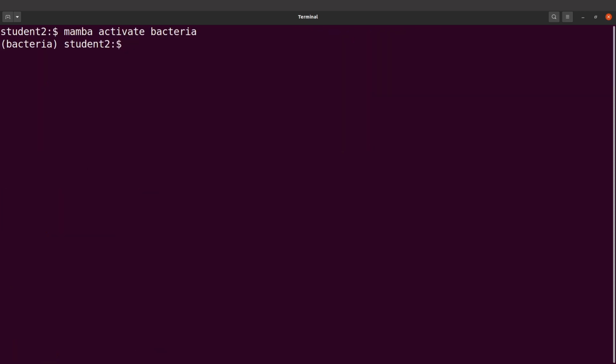So what we are going to do next is to create a working directory and then cd into it. So I'll say mkdir MRSA. You can use any name of your choice, it's fine. Or you can also say bacteria, that's fine. All right, so I've created the working directory. So I'll cd into it. So I'll say cd MRSA. Nice, that has been done. So now that we have created this working environment and cd into it, we can now proceed.